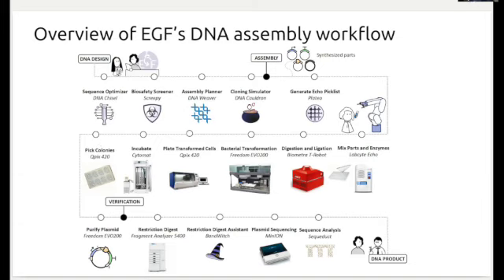In the DNA design phase, the customers usually come to us either with a combinatorial assembly plan or with a desired sequence that they wish to get. So we evaluate these sequences with our software DNA Chisel, which can both flag problematic patterns such as monomer repeats and also modify them in an automated manner. We screen both the customers and the sequences, the project and the constructs themselves, for biosafety.